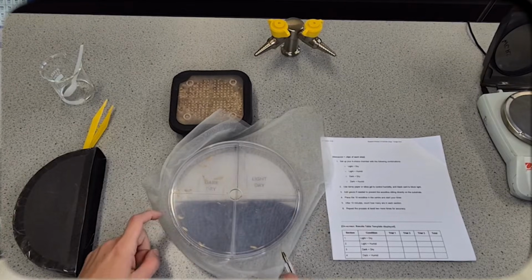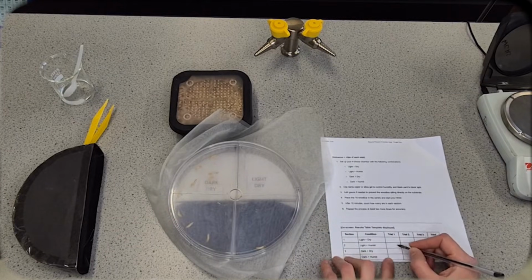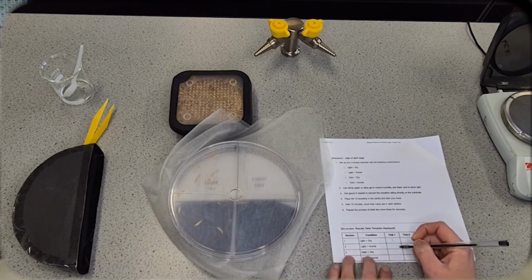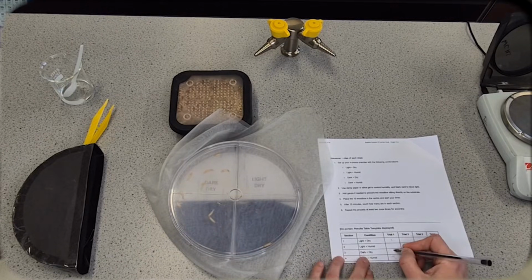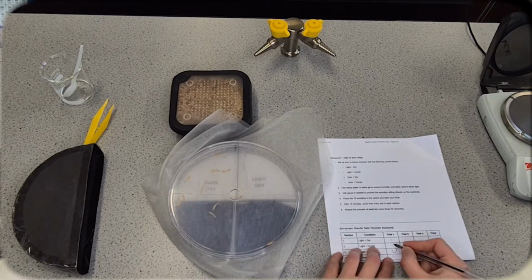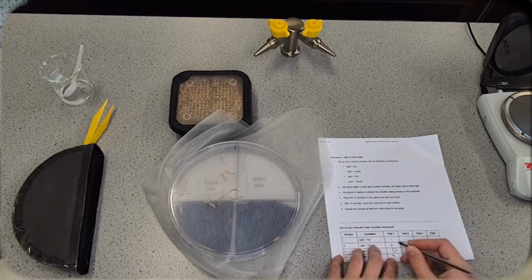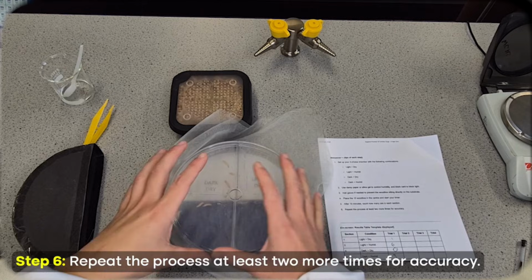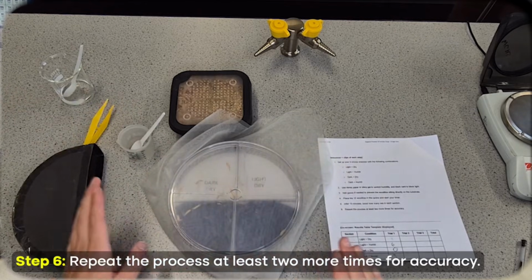All right, so I can see 1, we've got 1, 2, 3. So that was damp and light. It was 1, there was 3 here, which was damp and humid, none in that one, and then that must mean that there was 6 there because I added 10. Okay, so that is my first trial. Now what we'd need to do is take those maggots out, give the mesh a little bit of a clean, and we'll run it again.